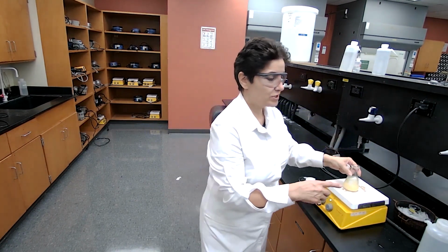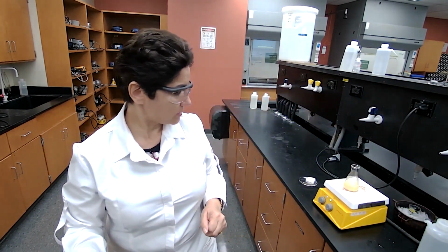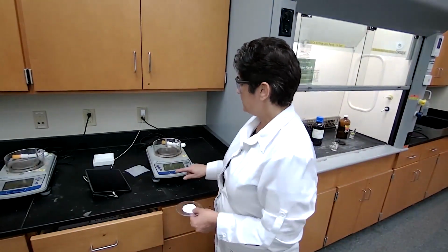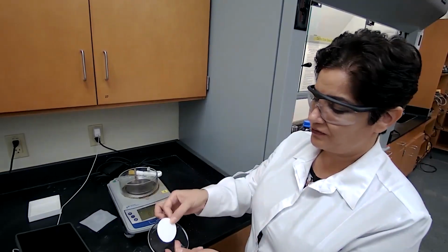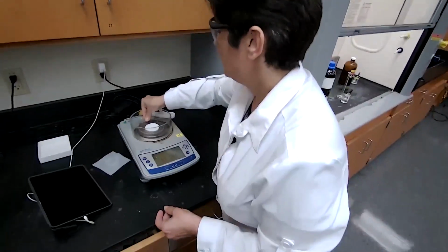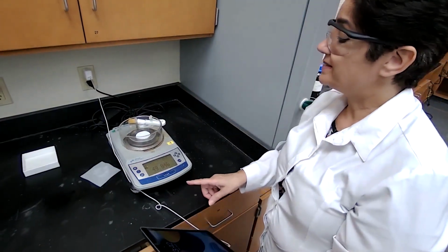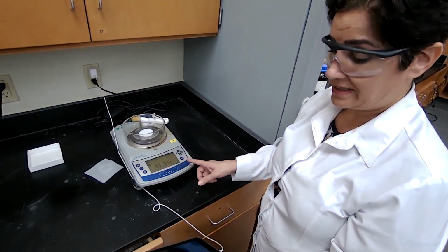For the vacuum filtration, we need a pre-weighed filter paper. So let's go ahead and measure the mass of the filter paper with the watch glass right here. We are using a watch glass with a proper size of filter paper. We're going to measure the mass, and the mass is 49.846 grams.